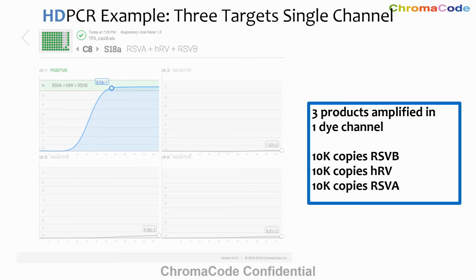Now I'd like to take you through a few examples using our respiratory viral panel platform demonstrator assay. The graph that you see in the background is a screenshot from our cloud software.